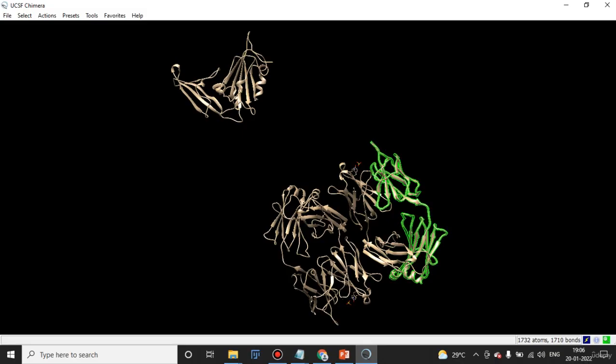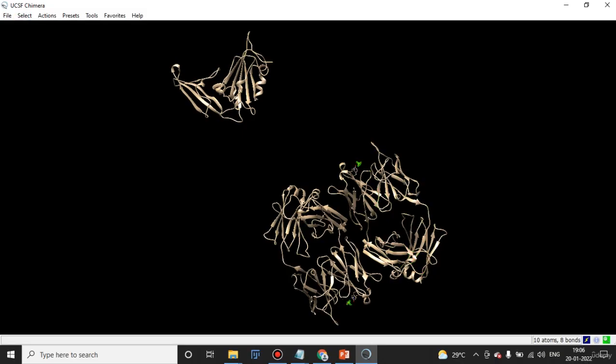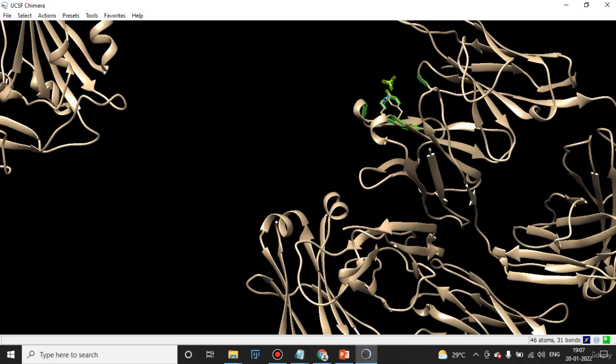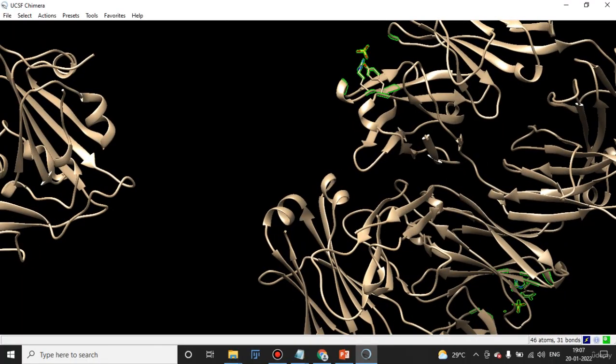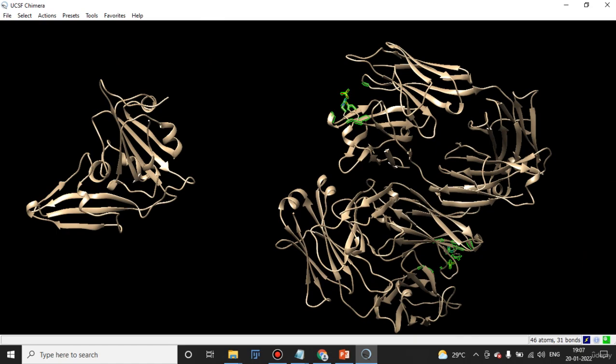This is where the ligand is. In this particular structure, this is your ligand and the ligand zones. Can you see? You can scroll down as well as scroll up, and minimize as well as maximize it. This is where the ligand binds, and these are all your antibody antigen model.